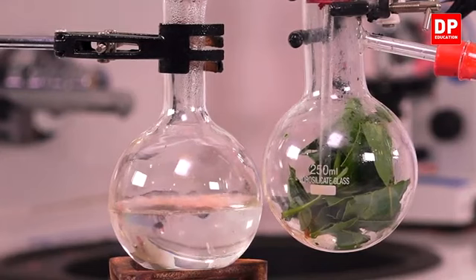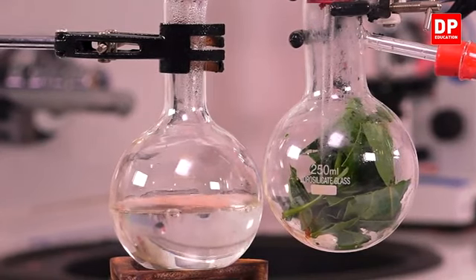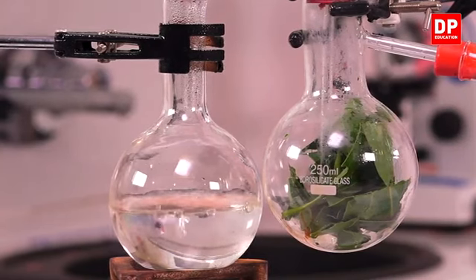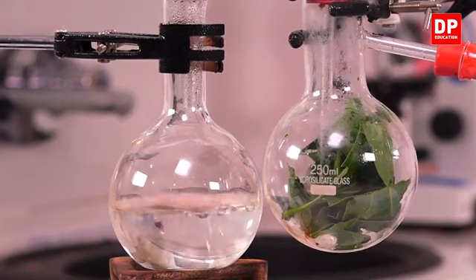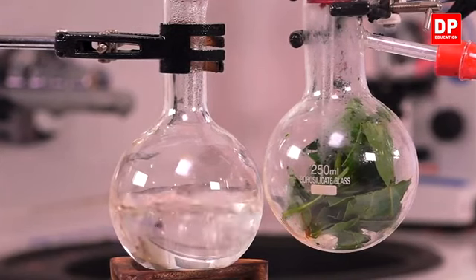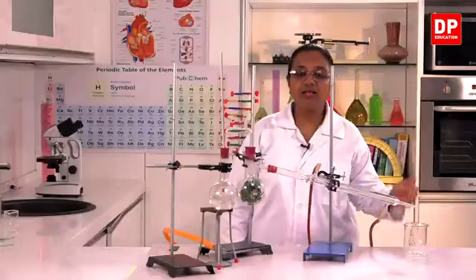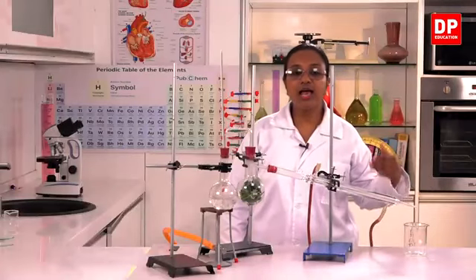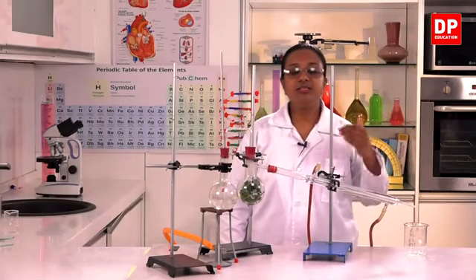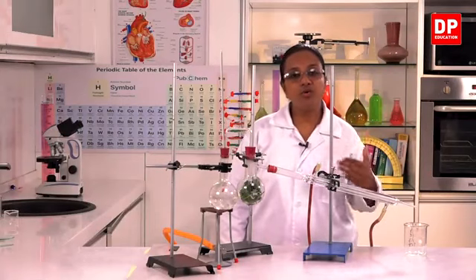And when they enter the condenser, as you know, due to the water flow, there is a cooling process taking place. Therefore, the vapor mixture will condense, and from this side, the outlet of the Liebig's condenser, we will be able to collect both water as well as cinnamon oil. So, as you know, cinnamon oil and water don't mix.